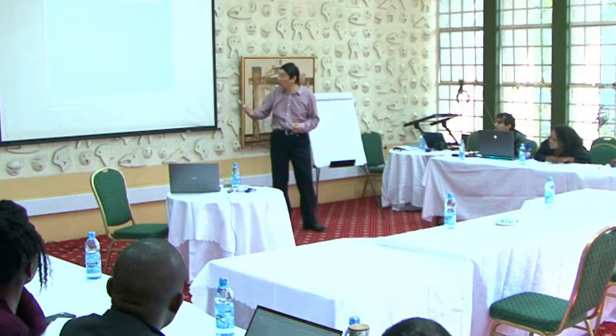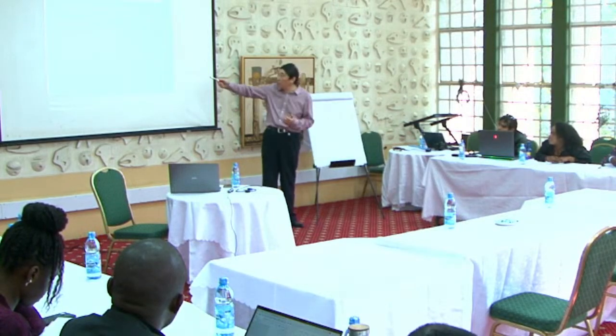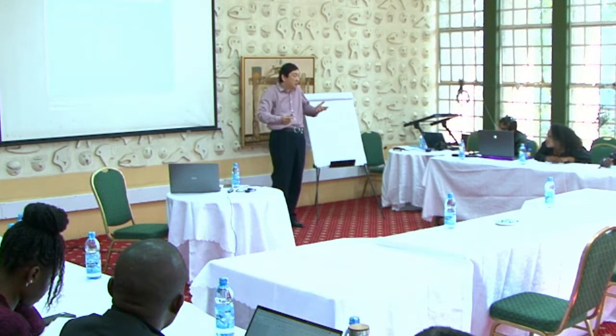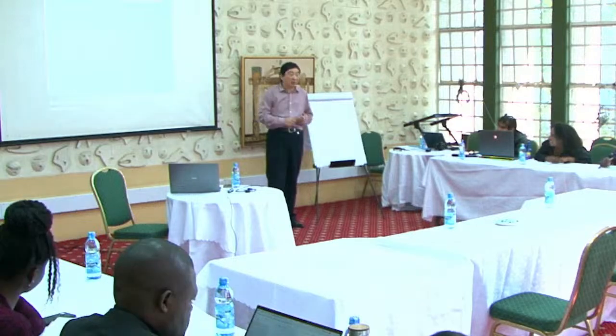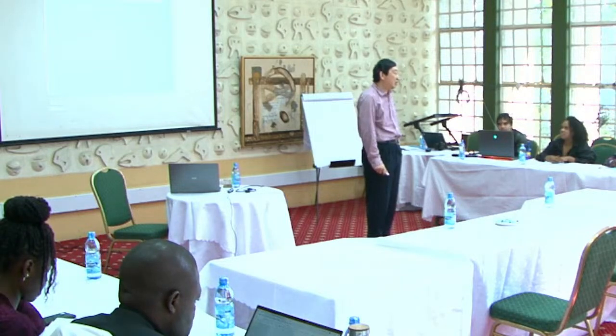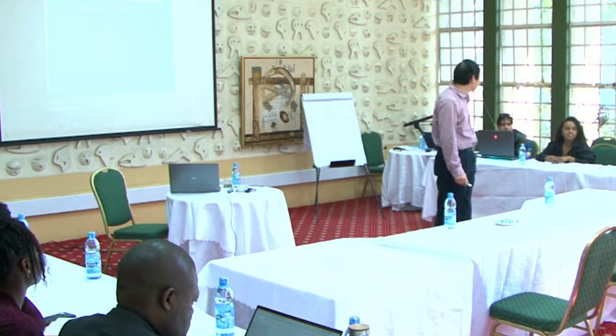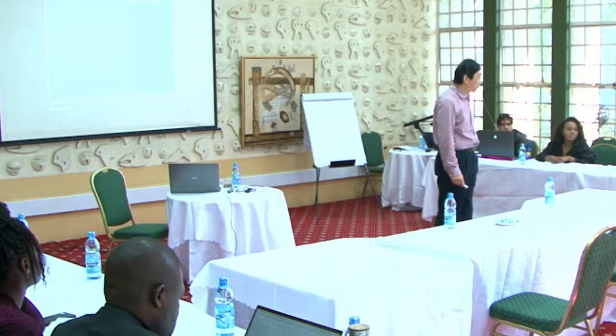So now you want to work with the molecular ion. Is it this one? For this one, it's so strong, so that's not a question. That must be the molecular ion. Of course, the difference could be 17. You do not have too many choices. What can make 17? OH. Yeah, OH, right?